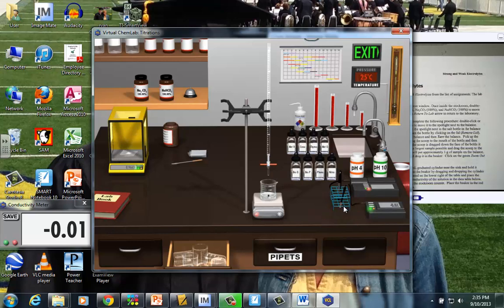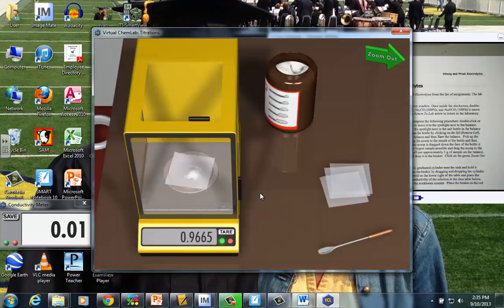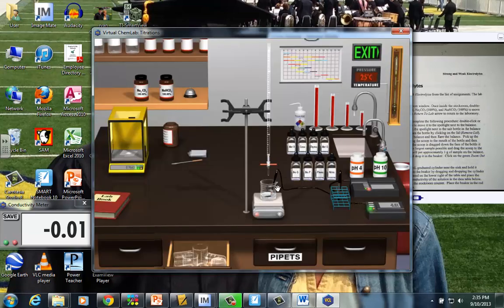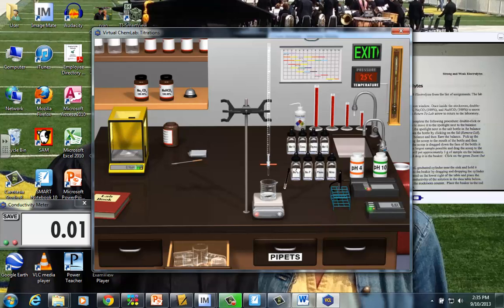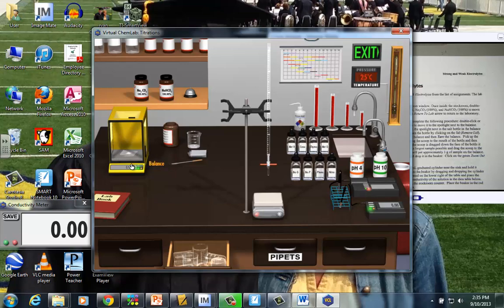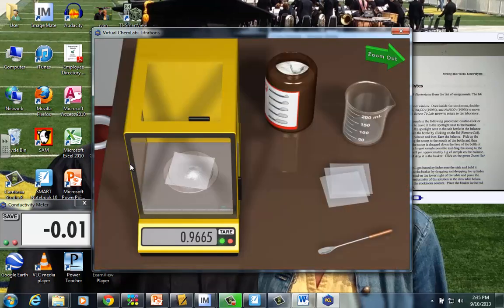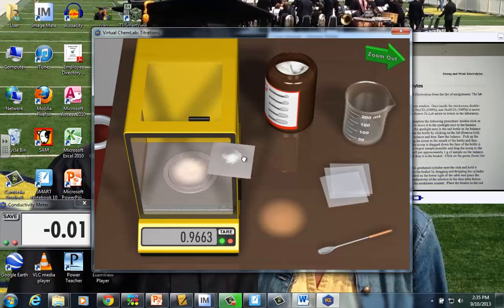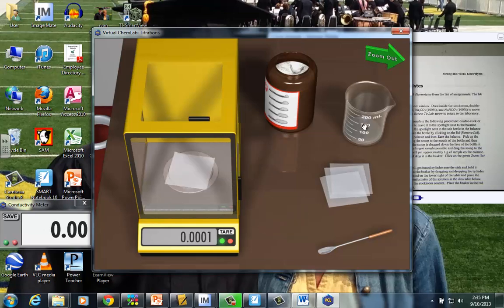What did I do? Oh, you know what I did? I never poured the salt in there. The salt is still sitting on the balance. Let me back out. That won't work. So, put this back in. No wonder it's reading zero. It's just pure water. Put this back up here. Grab the salt. And get it into the water. We probably have to zoom in. There, I got it. Now the salt is in there.